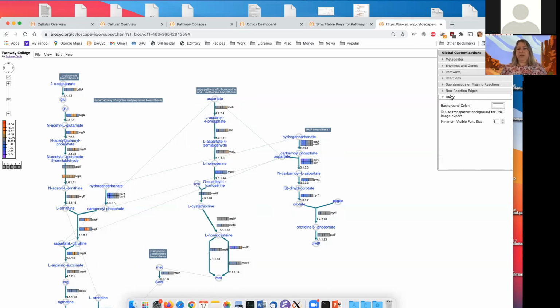Anyway, you can play with this. I can export this to a PNG or SVG file. I can save it to a file that can be loaded back into this application. This gives you help about some of the other operations. Oh, one thing I should say, I can also merge things.